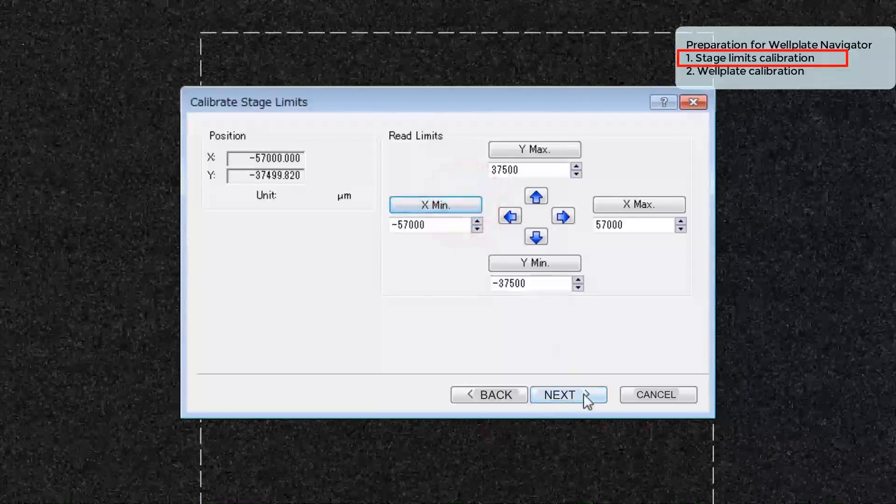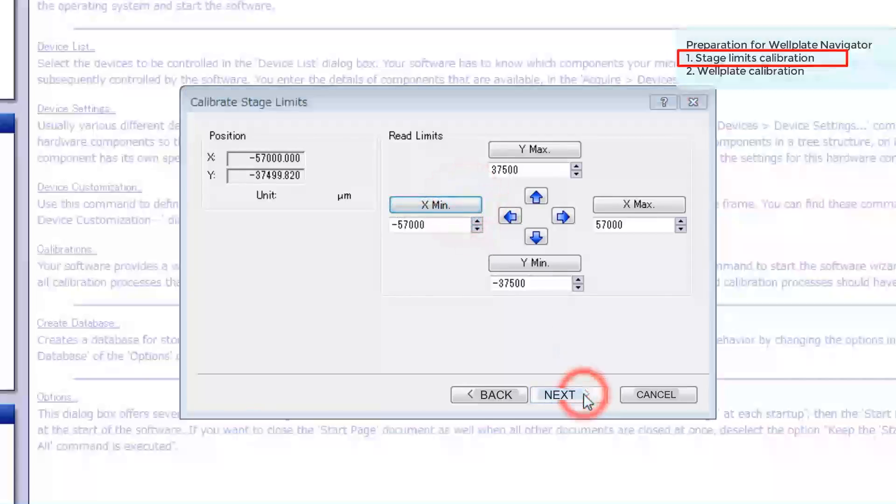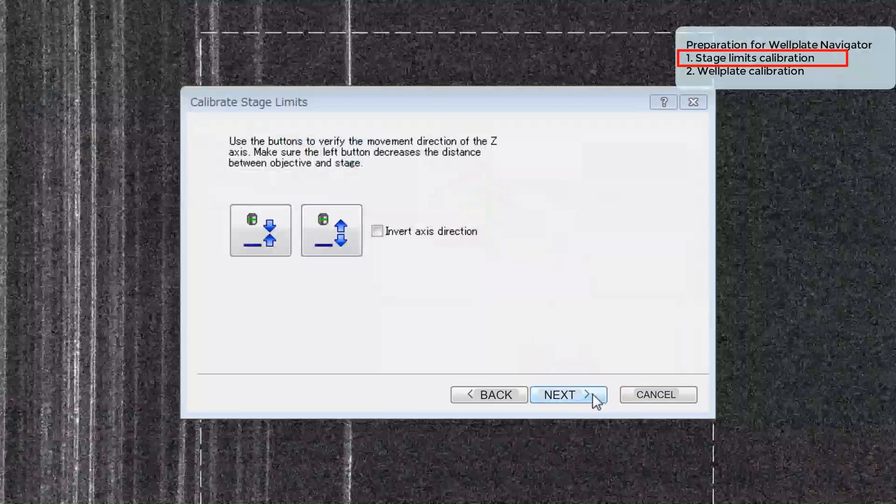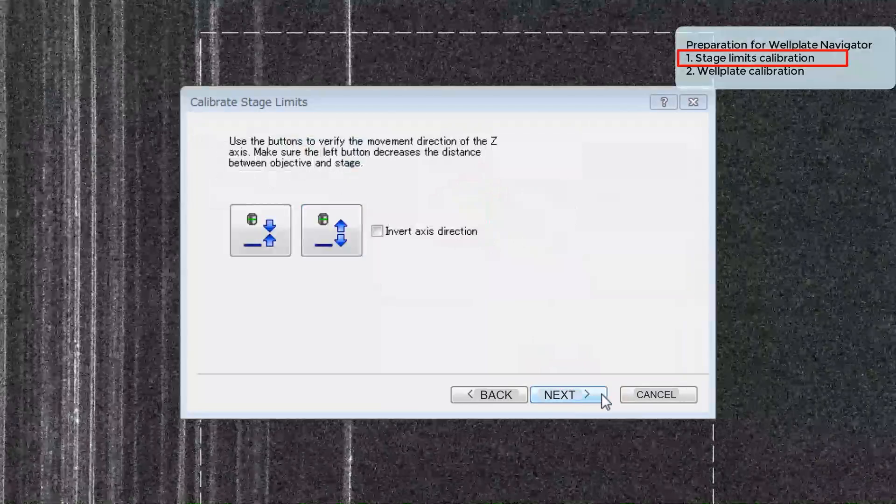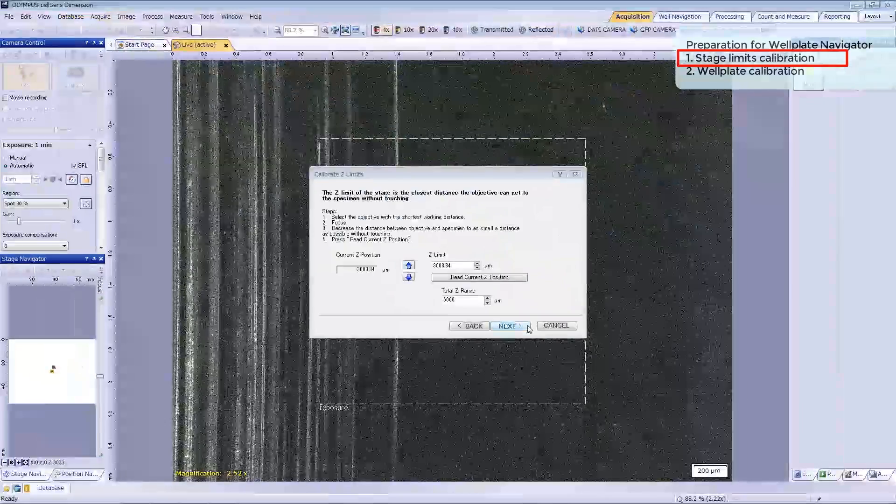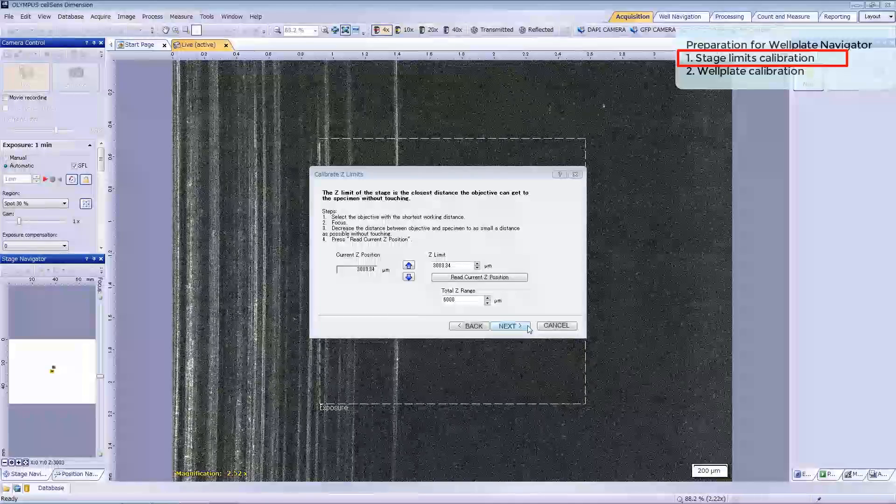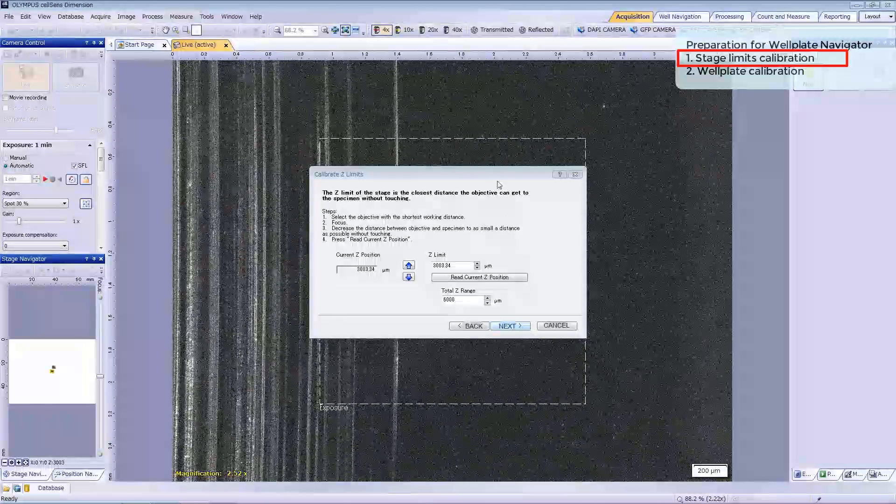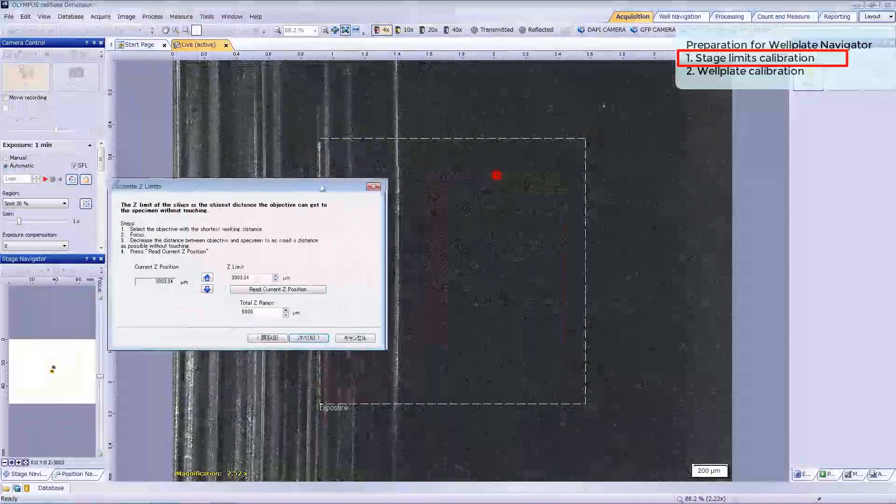Please click Next. Let's calibrate the Z limit. Here we can set the software limit of the Z motor to make sure you can focus on your wellplate.